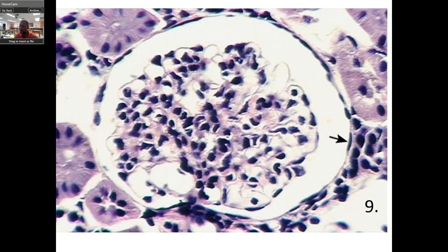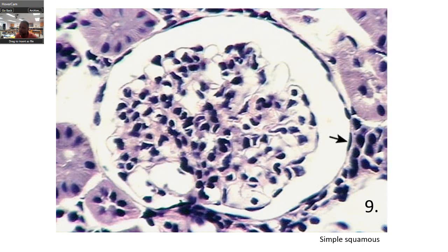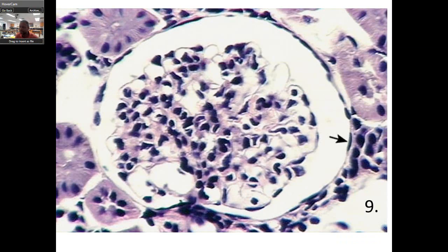Notice this flat cell — flat going all the way around. This is lining. One of the properties of epithelia is to work as a liner. That's simple — this is a flat, simple squamous cell.